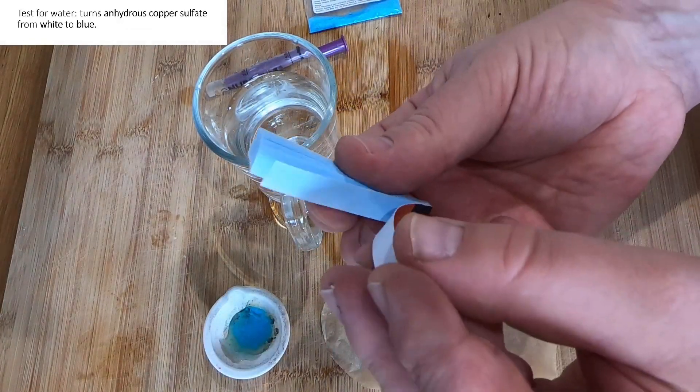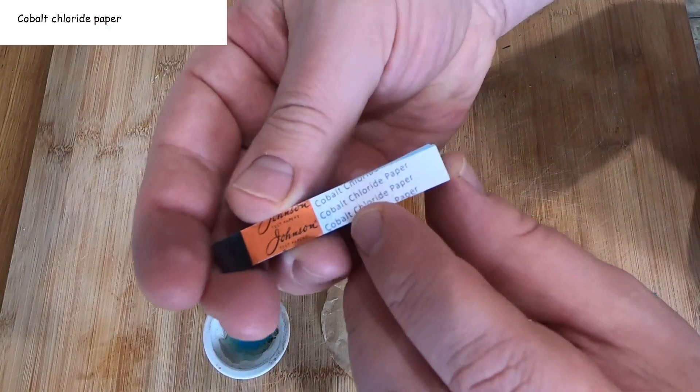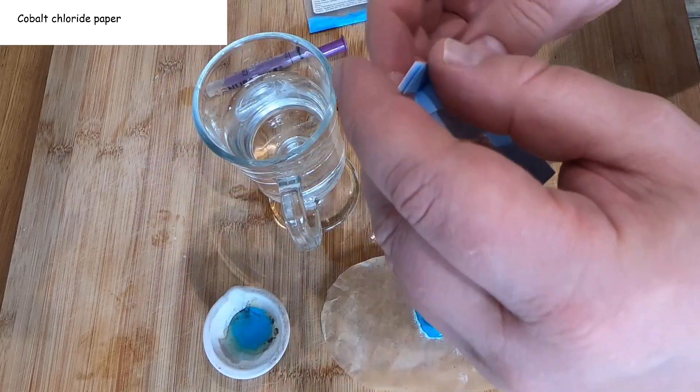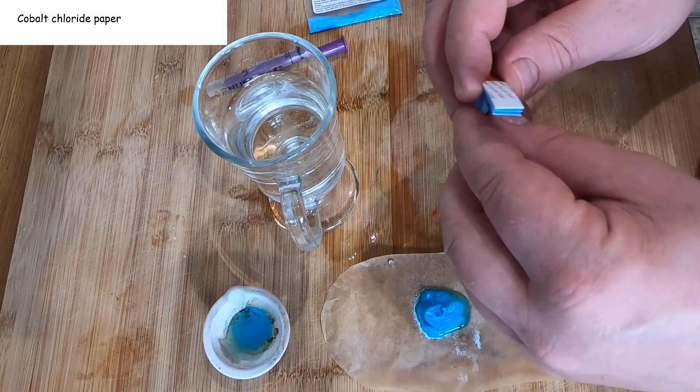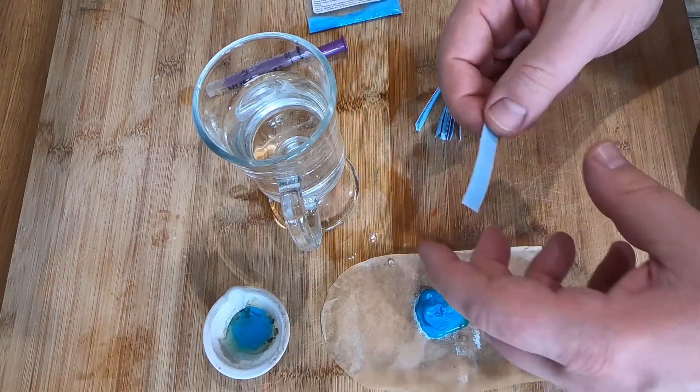So another test for water is to take this, which is cobalt chloride paper, as you can see here, and it's blue in color. I can make it bluer if I put it in the oven and evaporate any moisture from the paper.